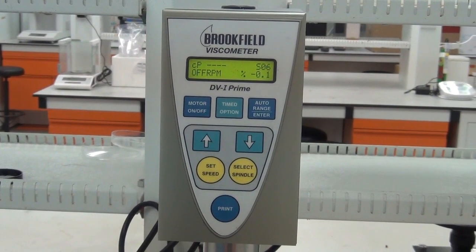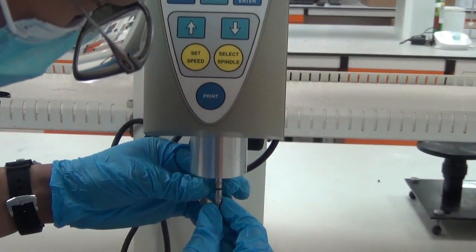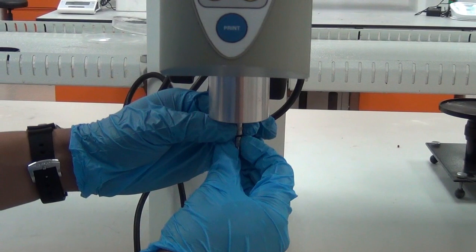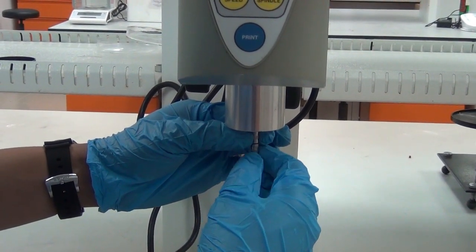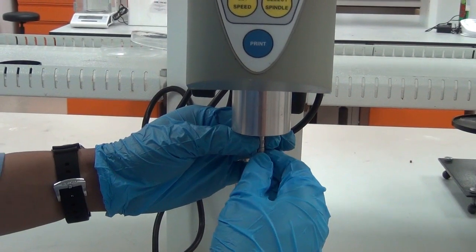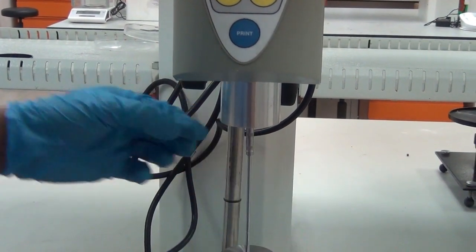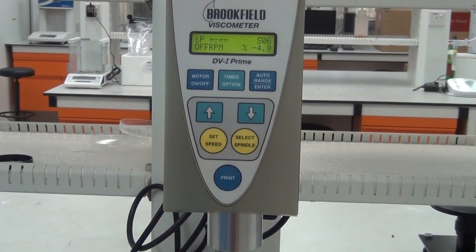How to attach this spindle? We need to push a bit, then rotate clockwise and make sure it is tight. Then check your error again.